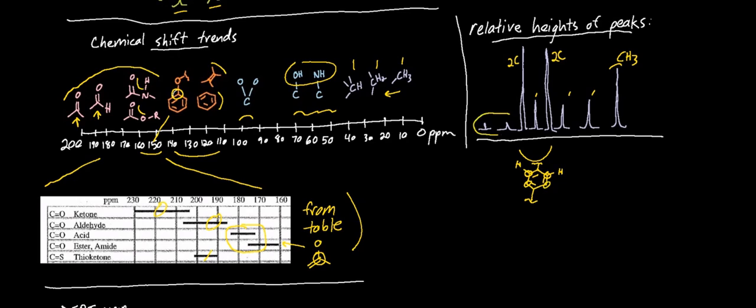If they're very short, they're often quaternary carbons. And the more deshielded one could very well be a quaternary carbon, like a carbonyl. All right, so you can't be 100% sure that if it's taller or shorter, it's one or the other, but some very strong differences, you can assume that in your problem solving, for a while at least.